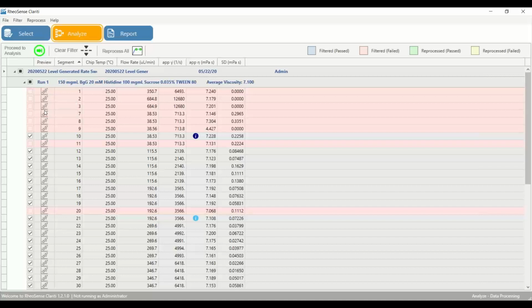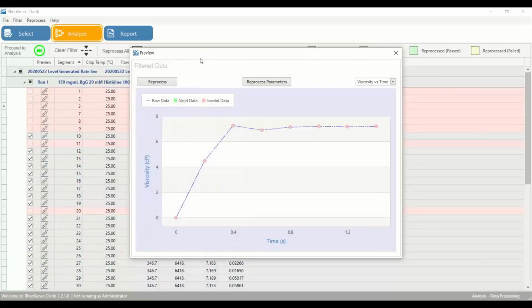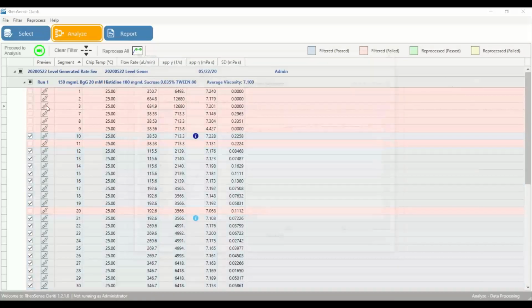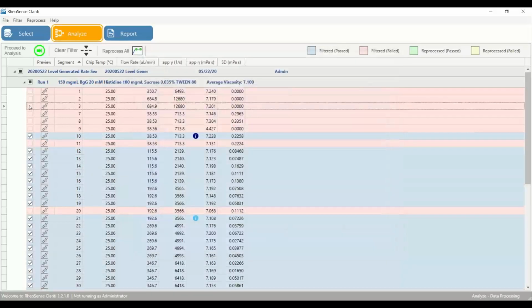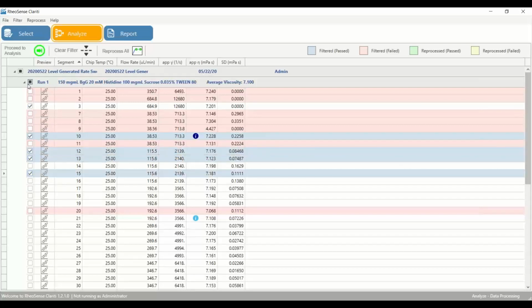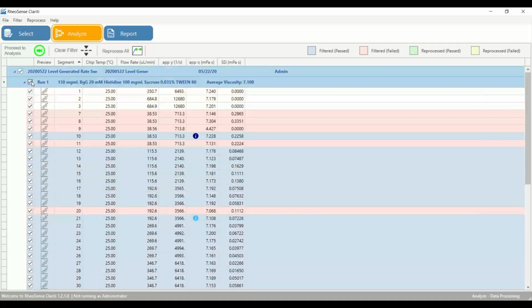So the first 3 steps are priming steps. As you can see, you can highlight over these squares and it'll tell you priming, priming, and then this says excluded, reprocessing available. So with priming steps, you can't reprocess the data, unfortunately. However, if you like your data, you can actually force it by clicking. However, then you have to re-click everything you want to include. So if it does this, what you can do is just select everything again.